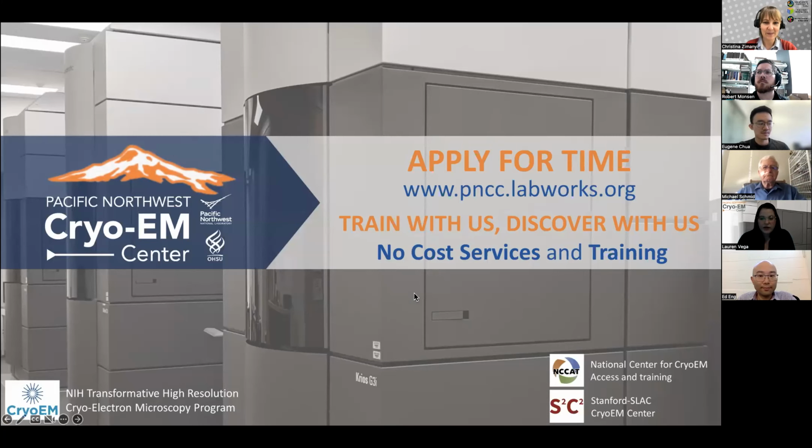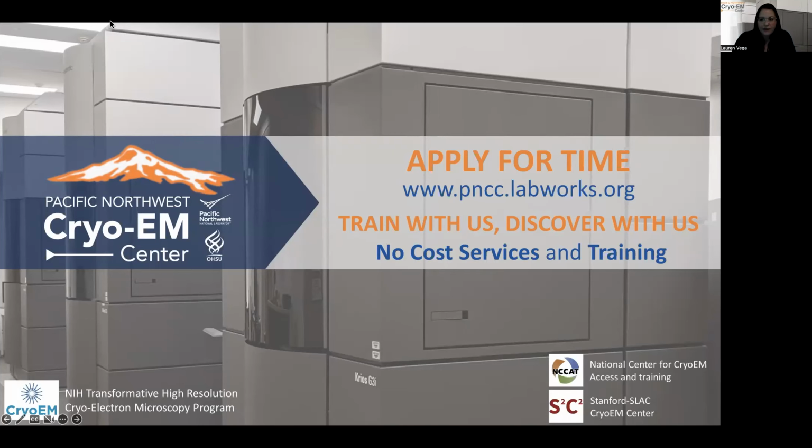Thanks, Christina. So for PNCC, I am the project coordinator, and at PNCC, we offer 2 proposal types to get access to our center. So we have a screening access proposal that is up to 5 days of on-site sample preparation optimization that is targeted to low resource institutions. We also have our general access that's for both single particle analysis and tomography and gives up to 480 hours a year and is valid for 2 years.